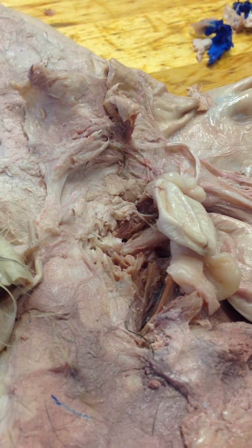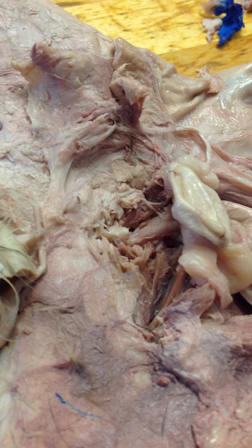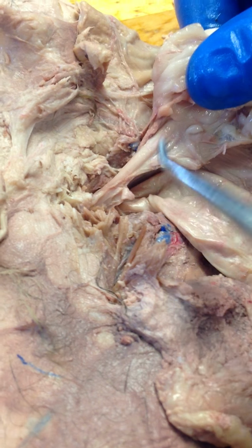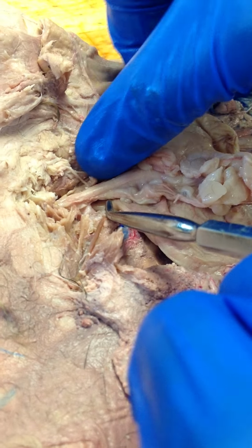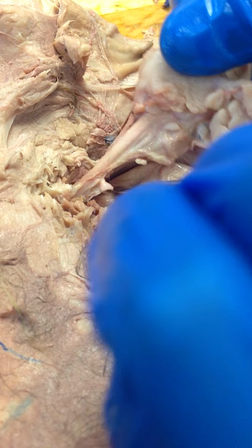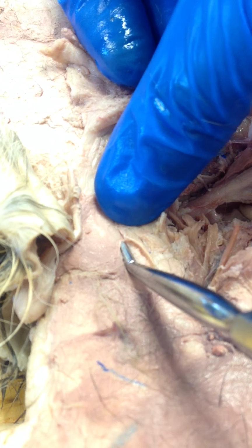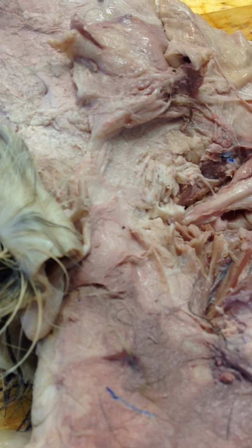Then the next two things we can't find. Prostate gland. They maybe found it. I'm still trying to expose it. Anyway, there's a bone that was cut across here, and according to the diagram, the prostate gland should be right under the urethra, above the rectum, right around here. And there's another crossbar along here, and under that should be the bulbourethral gland, also under the urethra and above the rectum.